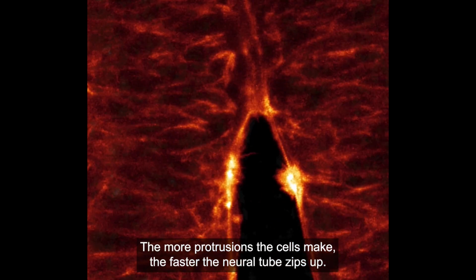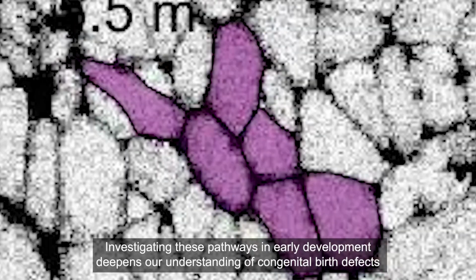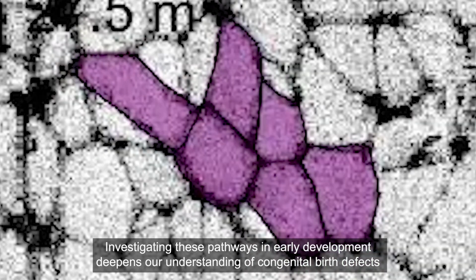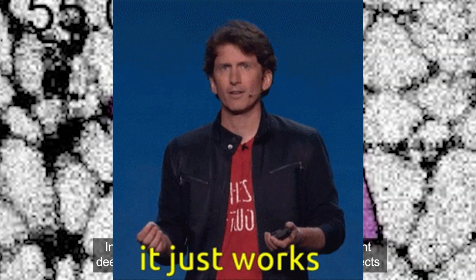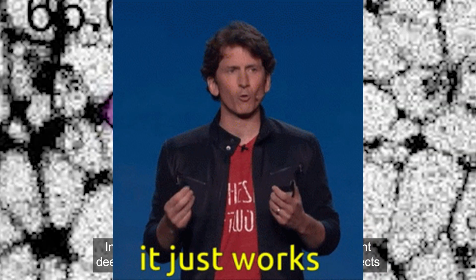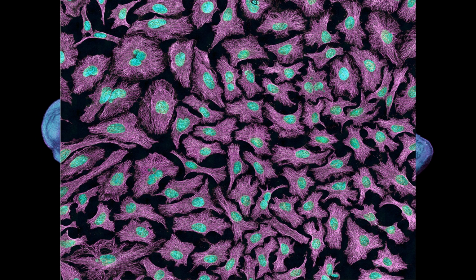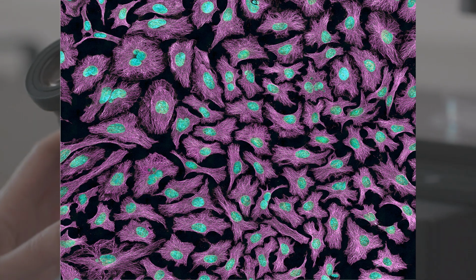When this works as intended, it allows for the protein itself to have an inherent fluorescence, and therefore you can locate and track proteins without any issue whatsoever, and without having to add anything at all to the cell. So you don't need stains, you don't need antibodies, you just are able to image the cell directly. This is ideal if you're trying to look at a live cell that's working as it's meant to be, rather than trying to catch cells at different stages and get snapshots of time and basically have a single destroyed sample at the end of that.